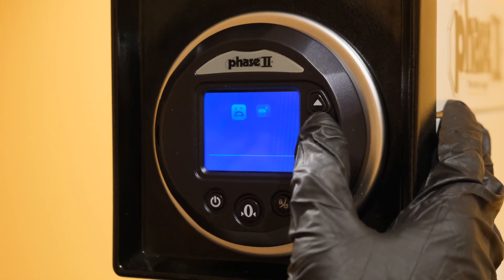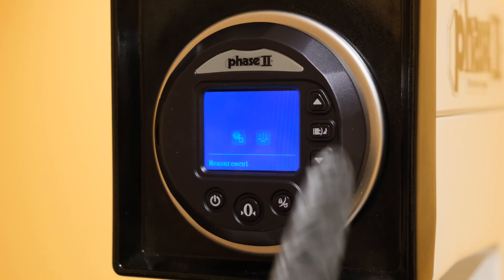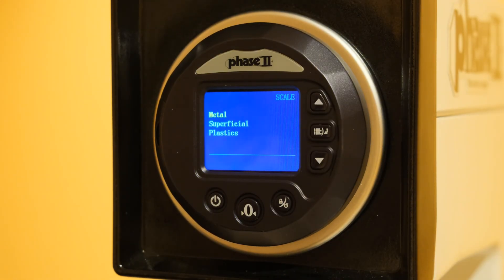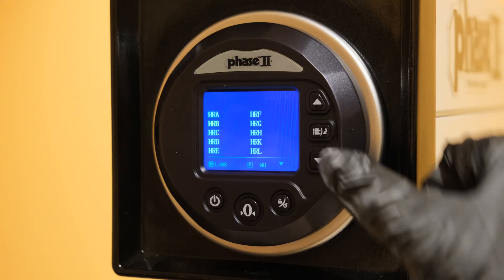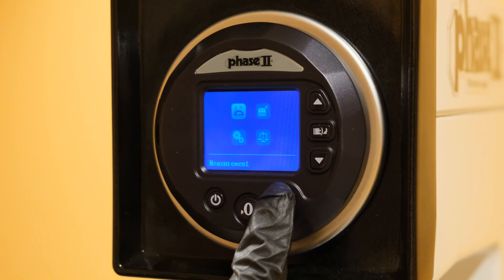The digital indicator has expanded functionality outside of just making results easy to read. Pressing the function button on the right will enter the settings menu where parameters like scale, conversion, and autosave can be set. For further information on navigating specific functions of the digital readout, refer to the documentation in the latter portions of the manual.